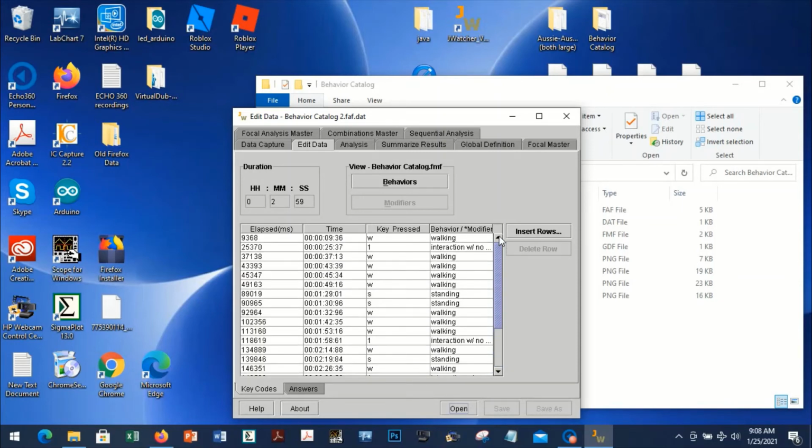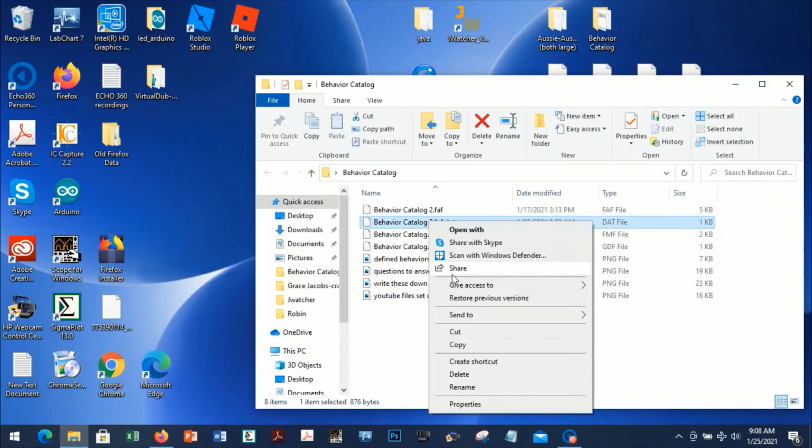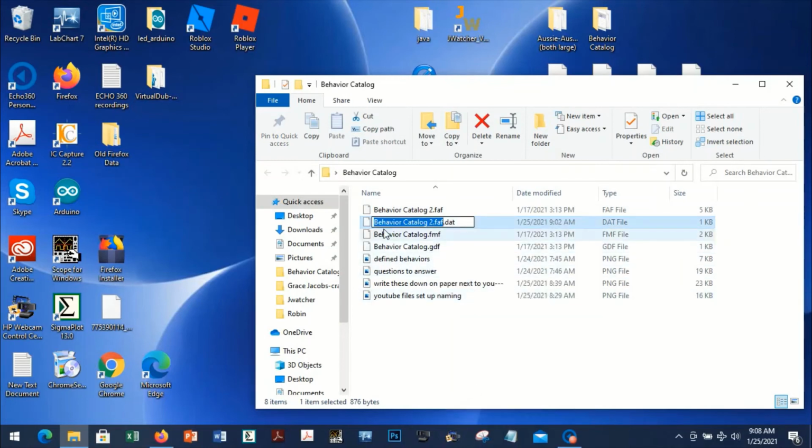That's why you don't want to override that file. So what we could do is go back and rename that. That might be the best. Rename it like YouTube 1. And it's the first crayfish. Oh wait, maybe we should do something like this instead.